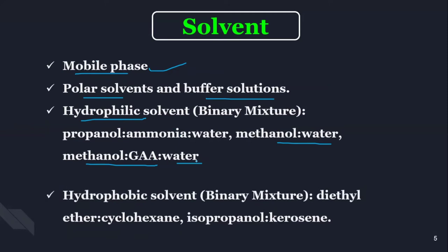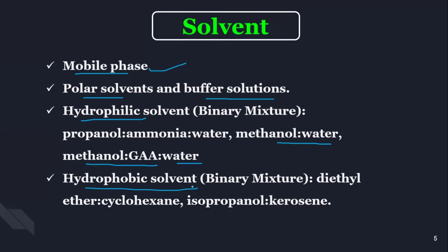Then later on, one more type of solvent is the hydrophobic solvent. Again, it depends upon what your sample has to be separated. For hydrophobic solvents, you can consider diethyl ether, cyclohexane, isopropanol and kerosene. So there are so many different types of solvent you can use for the separation.